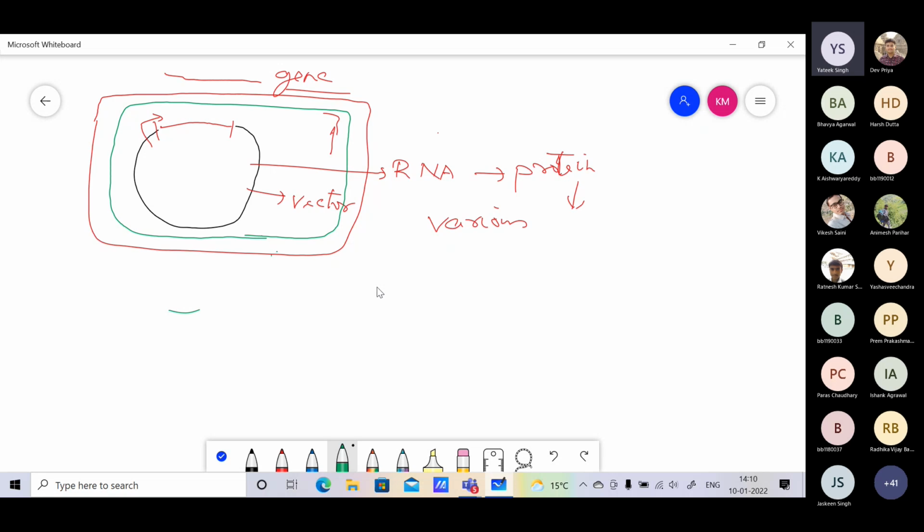They may appear very simple, and over a period of time, these jobs have indeed become simpler with the emergence of kits and much better equipment, but still it is quite a lot of art and only a little bit of science. So I would suggest that you begin paying attention. My students here will demonstrate each and every step, but it will be like a cookbook. They will cut out all the intermediate waiting steps because obviously there is no time and it makes no sense in a practical which is demonstrated online.